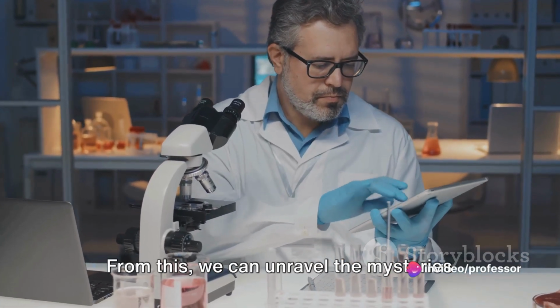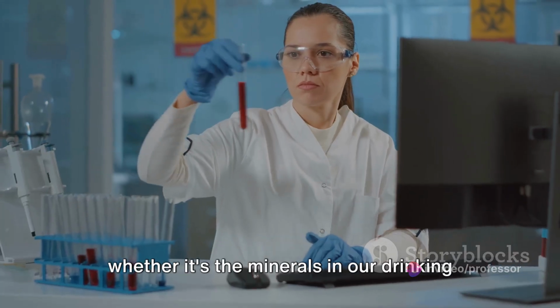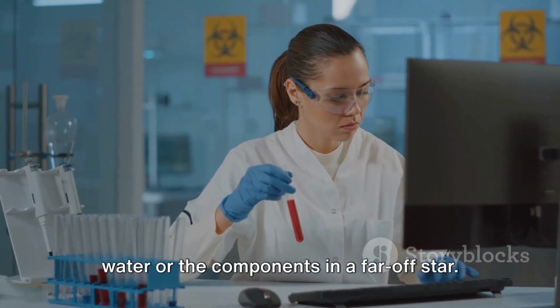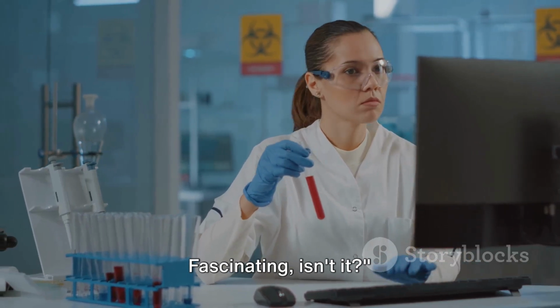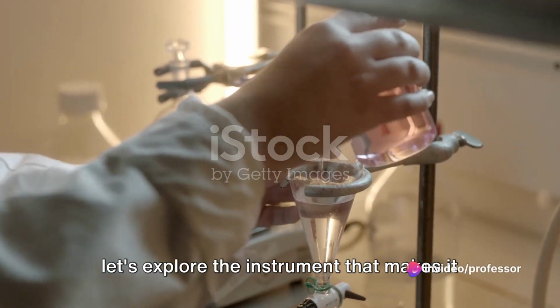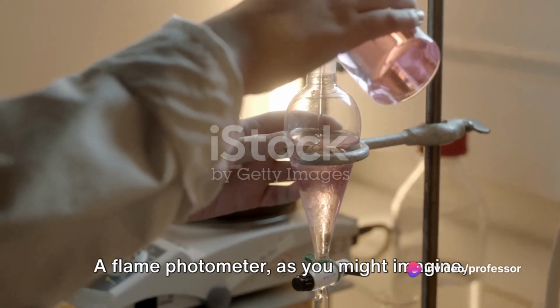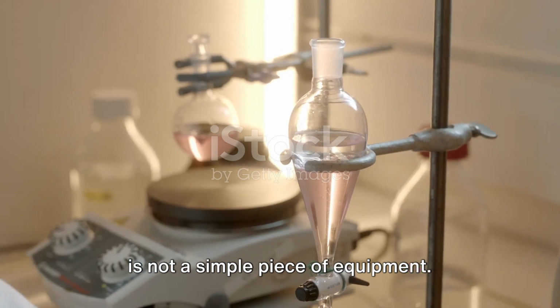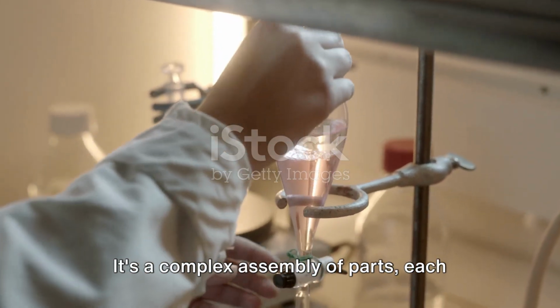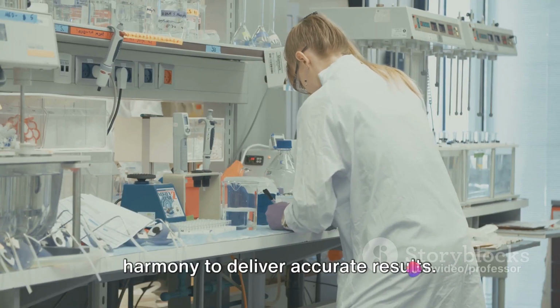From this, we can unravel the mysteries hidden within different substances, whether it's the minerals in our drinking water or the components in a far-off star. Fascinating, isn't it? Now that we understand the principle, let's explore the instrument that makes it all possible. A flame photometer, as you might imagine, is not a simple piece of equipment. It's a complex assembly of parts, each with its unique function, working in harmony to deliver accurate results.